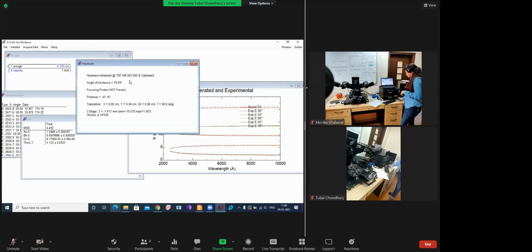Hello, ma'am. How do we decide that our glass substrate is optically smooth or not? Okay, as I demonstrated yesterday, not just glass, anything you want to know is optically smooth or not, what you have to do is, if you have ellipsometry in your lab or not, you have a pointer in your lab. Subhay, can you just bring a pointer, please?